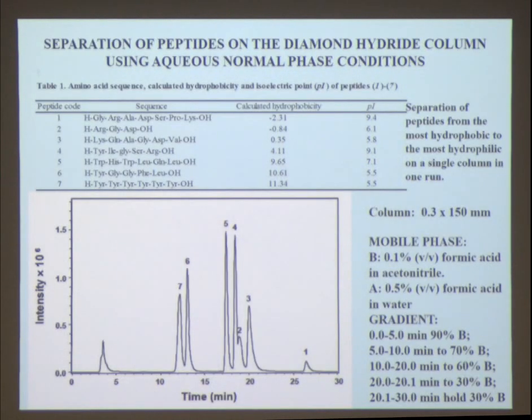Now this is another interesting application that we worked on with our collaborators in Australia. We took a series of peptides of varying properties, and the distinguishing property that we're looking at here is hydrophobicity. And you can calculate how hydrophobic a molecule is.